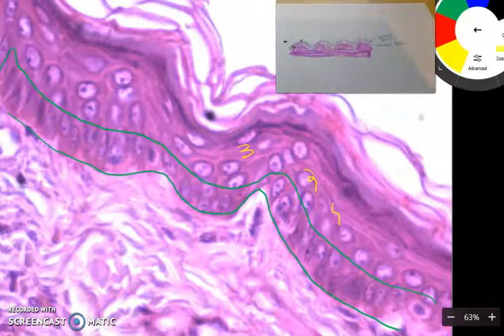And now I have this area up here. That's the stratum spinosum. And I picked this slide to look at because it's only 4 or 5 rows thick. In my drawing and lecture, I think I made it 12 or 13. That took a long time to color in. Now this coloration is different from the stem cells. Part of the reason is that's a melanocyte. That's definitely a melanocyte right there. So you have some melanocytes adding color to this row. So this area is a lighter color.